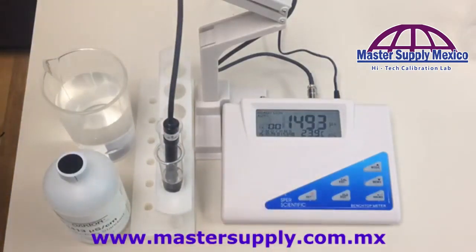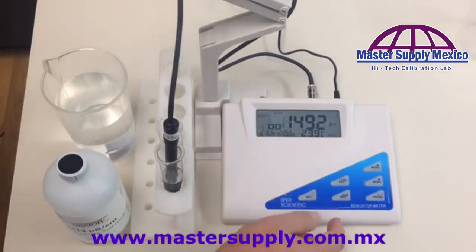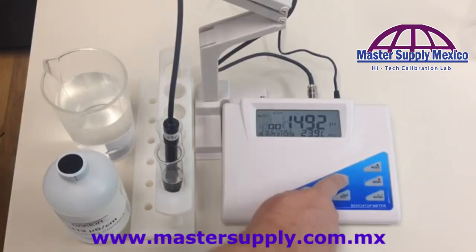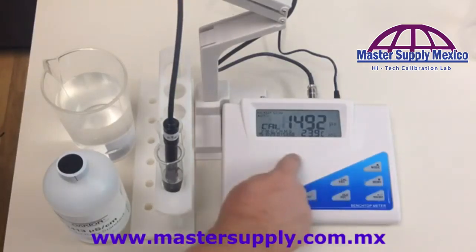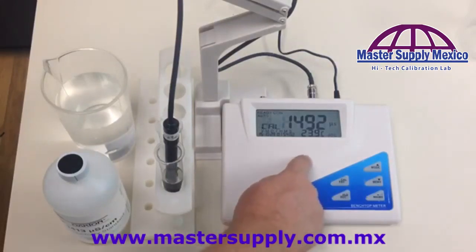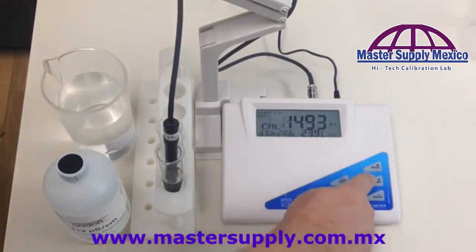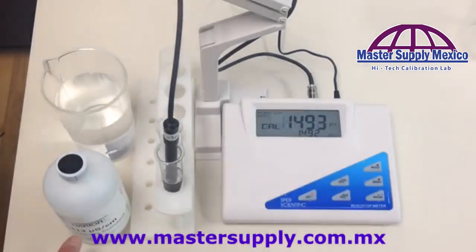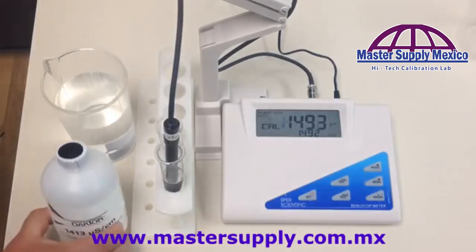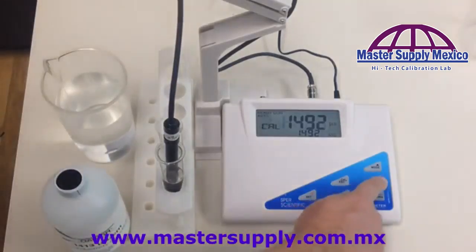Once you know you're in the right mode, you're going to start calibrating the unit. Because it's an auto calibration, it's very simple — all you do is hit the calibration button. The unit will now start calibrating; wait for it to stabilize. Then use the up and down buttons until you get to 1413, because that is our calibration solution.